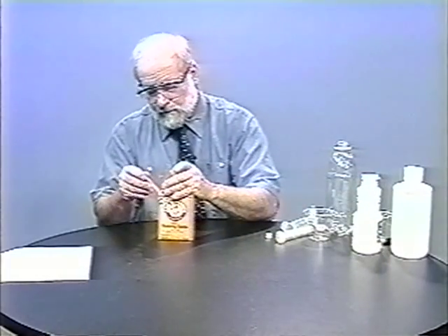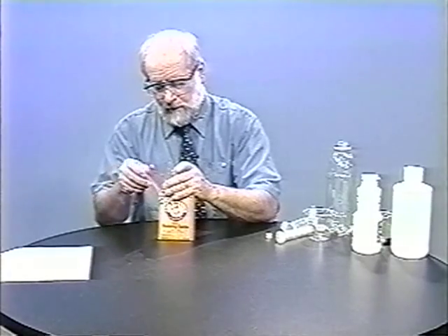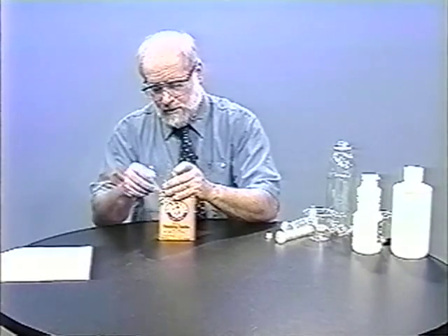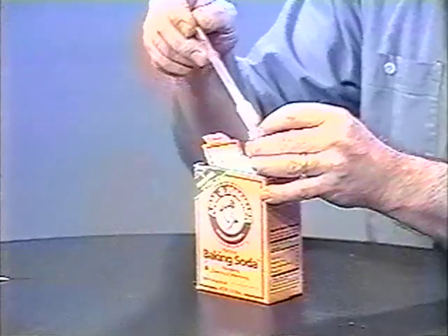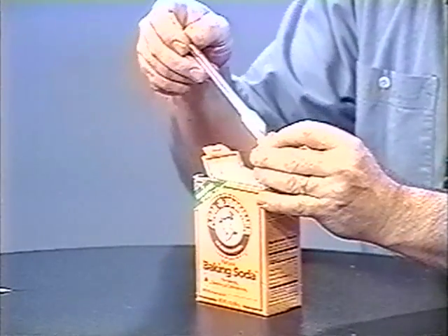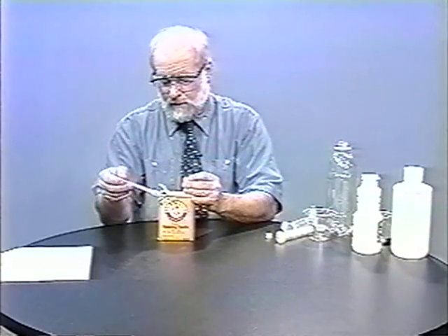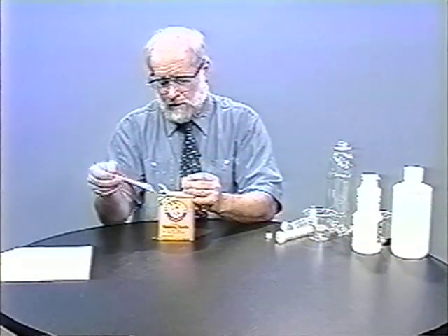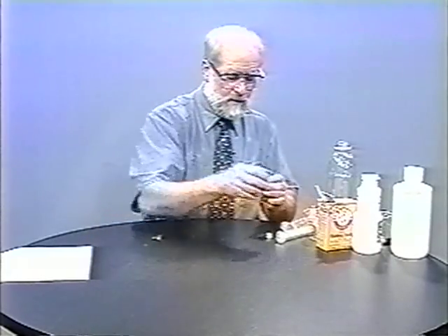The first thing we'll do is measure out the solid reagent. In the TV studio, we don't have a balance, but we want to use about 0.2 grams of the reagent. That looks like about the right amount, and that's placed in the little vial cap.